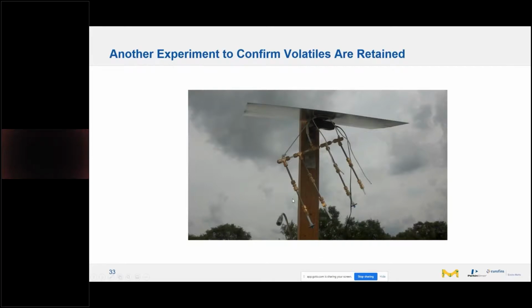In this example, we were looking at toxic components, though, and what we did here is we put a back tube. So the front tube is the primary tube, and the back tube is run as a blank before it leaves the laboratory. And then when it comes back, we can determine if any of the terpenes transferred onto that back tube. Since Jamie did a lot of work at many different sampling volumes, we're only presenting some of this work. We have that data already.